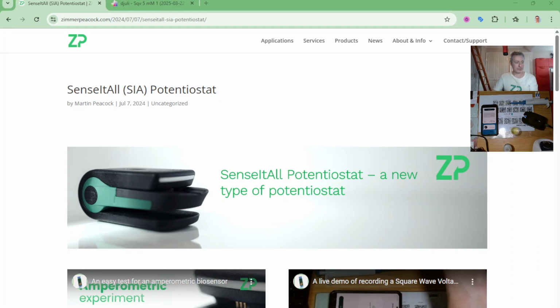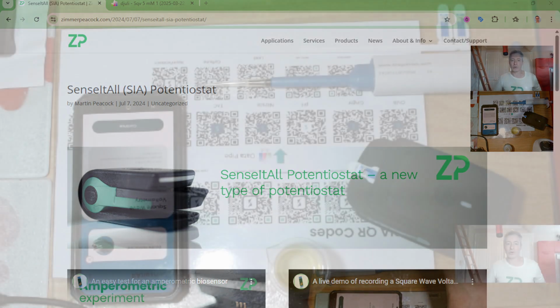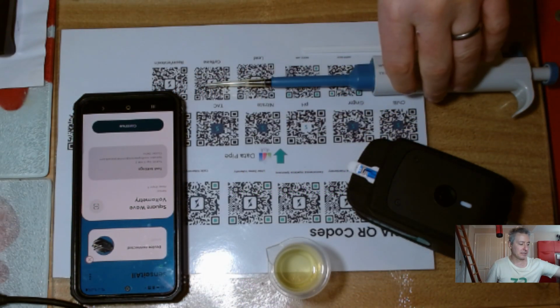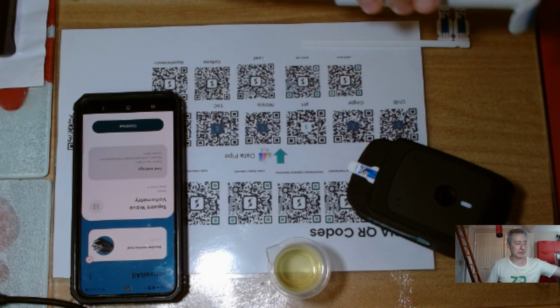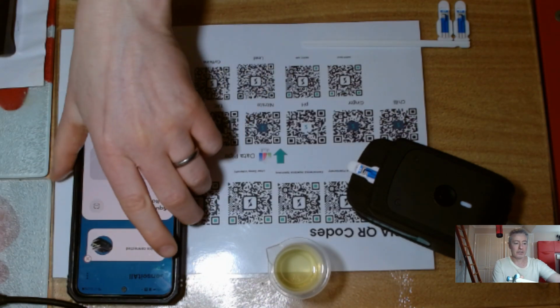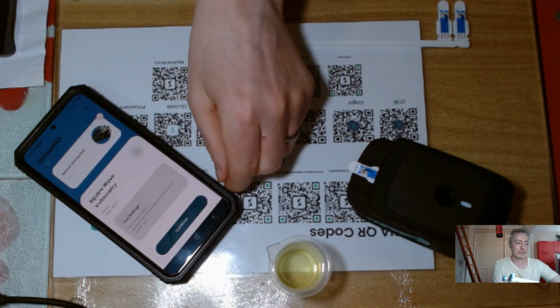In it, I'm really just going to do a square wave voltammetry experiment and use that experiment to discuss why I really love square wave voltammetry. I think I like square wave voltammetry probably even more than I like EIS. And when I say I love square wave voltammetry, I actually mean in the context of biosensors and electrochemical assays. It's not mysterious. It just gives us such good signals and so many handles to essentially play upon.